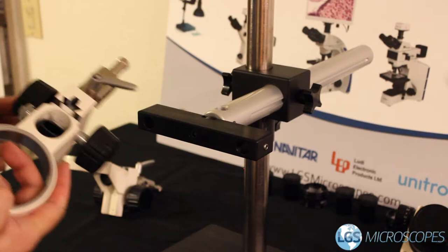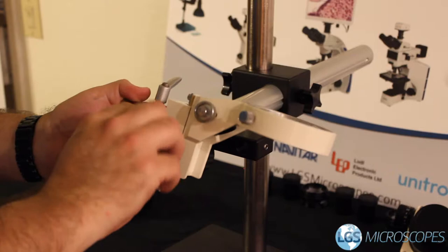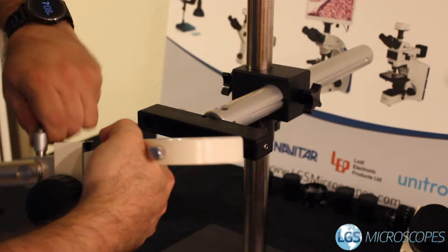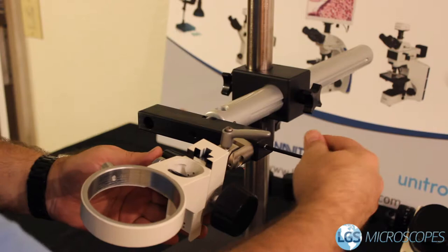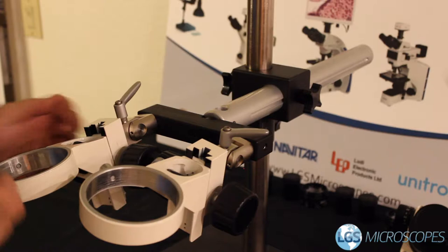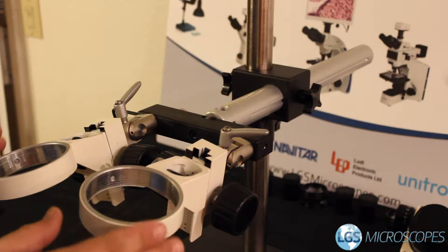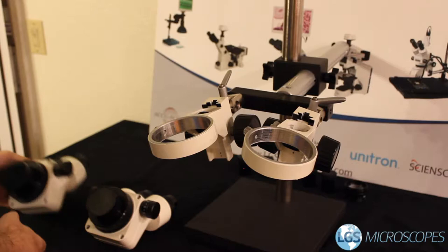Next we're going to work with our focus blocks. These ship leveled fairly flush, and they travel all the way down or all the way up. Set this roughly to the middle of the travel for setup purposes, and make sure this axis is almost perfectly straight. Tighten that down good and tight, then install it with a little bit of a tilt, and tighten down the screw with the smaller allen wrench. Install the second focus mount the same way — again set roughly to the middle of travel with a little tilt — and make sure both look roughly symmetrical, which will help us later on.